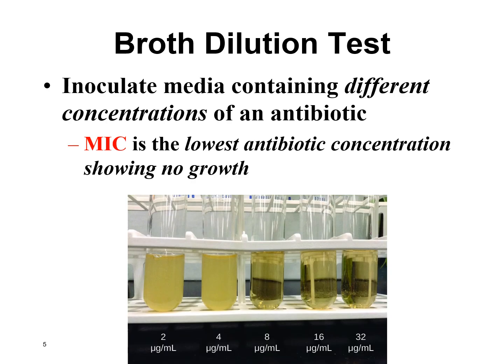On your lab report, they would say penicillin, the MIC is 8 micrograms per mil. And then they'd have a way in the lab where they could tell you if that would be susceptible, intermediate, or resistant, depending on what levels you would reach in the body, depending on the doses that are given. As long as you can reach above that 8 micrograms per mil at the site of the infection, then penicillin would work and would get rid of the infection.